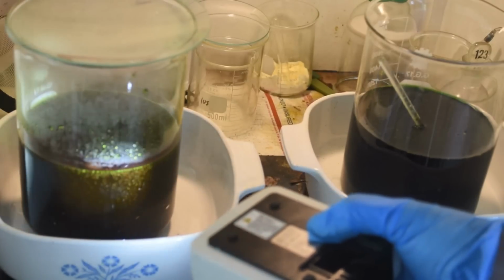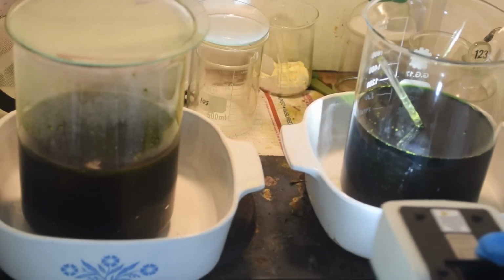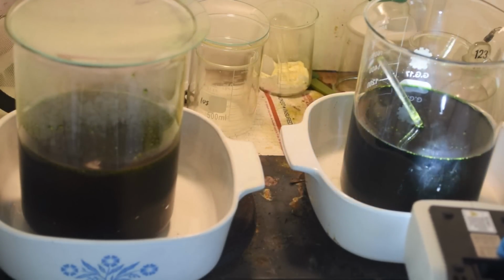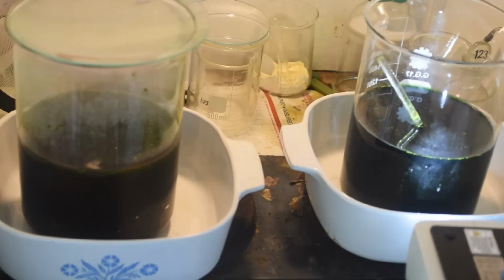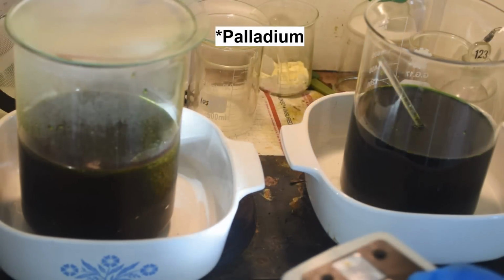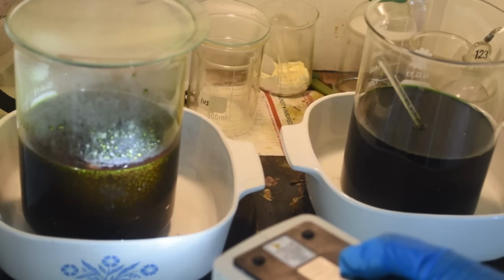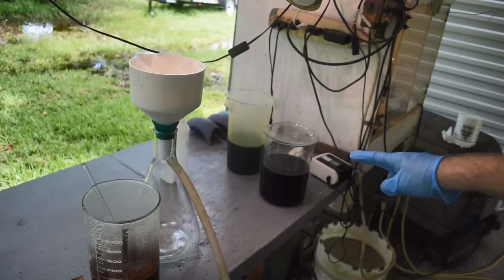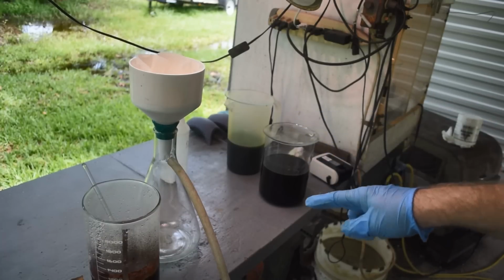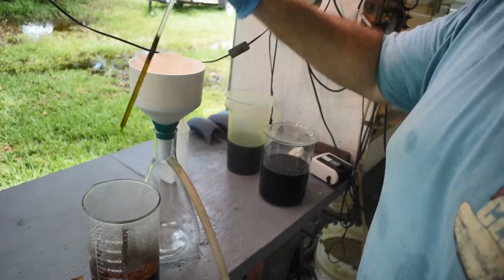So I can filter the palladium ammonium chloride out of this too. And I'm starting to warm up another one. I already got the ammonium chloride in it, stirring it in, getting it to dissolve, and I'll do this one too. And I will start filtering the palladium ammonium chloride out of the ones I've already done, and just keep this assembly line going 1 liter at a time until I get through all this liquid. Okay, so here's the liquid that still needs to be processed. Here's the first batch that's gone through.